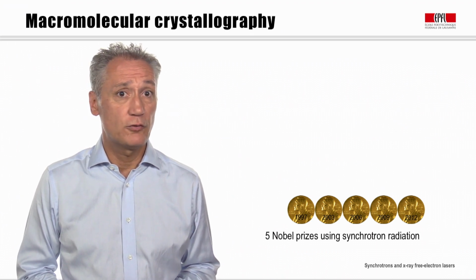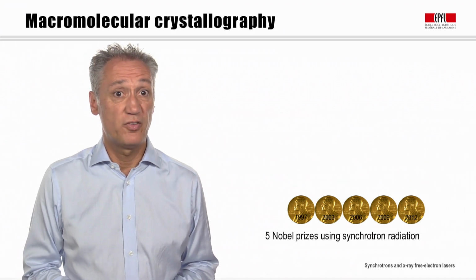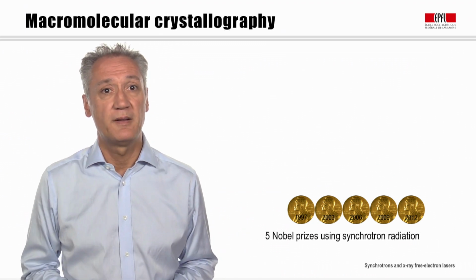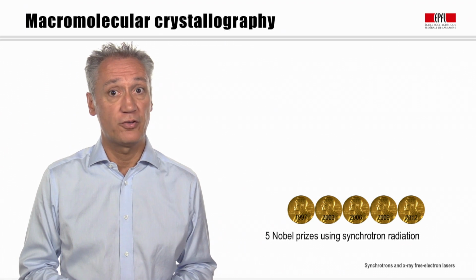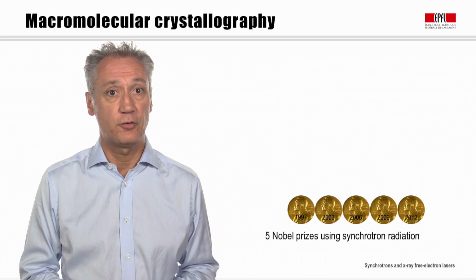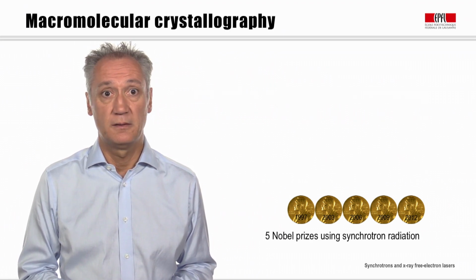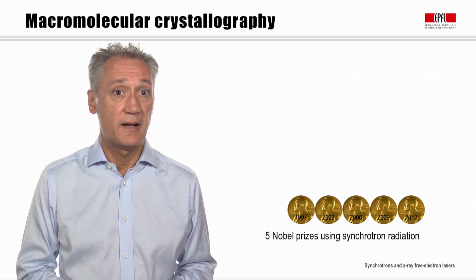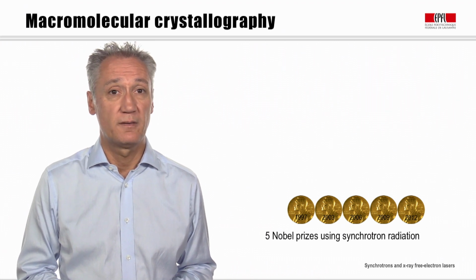MX is a form of single crystal diffraction, which uses the rotation method. What, therefore, is the justification for discussing this separately? Well, as mentioned above, the determination on an atomic scale of the 3-dimensional structures of proteins and related biological molecules is fundamental to understanding biological processes at the most basic level. How macromolecules interact in a lock and key manner and how enzymes catalyze reactions is of highest importance.